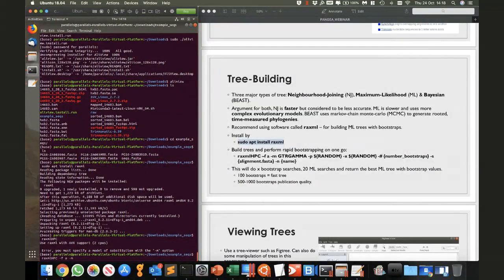So you can build trees using amino acids, or you can build using nucleotides. We're using nucleotides at the minute, so we'll use something called GTRGAMMA, which is kind of like the default one that's in all of the tutorials.